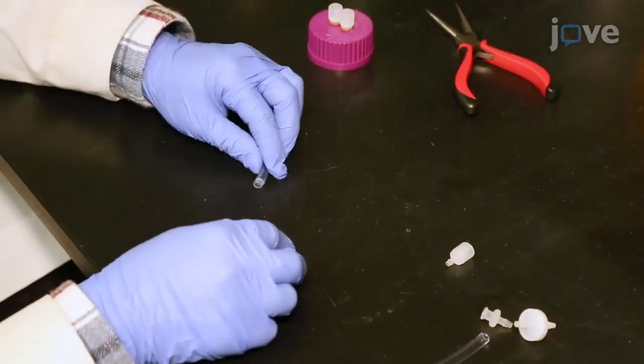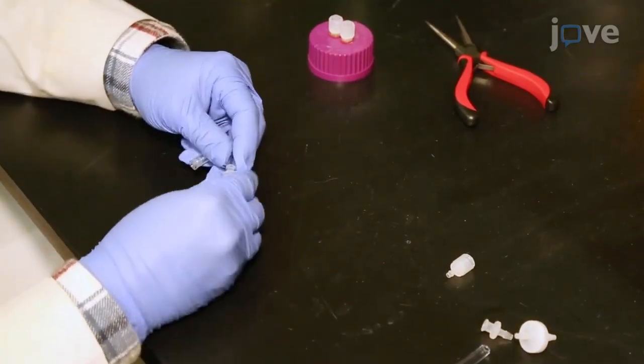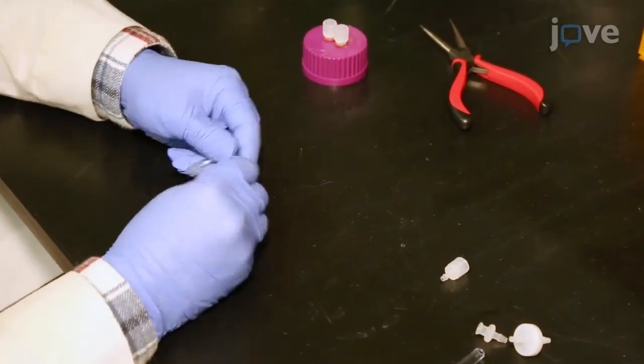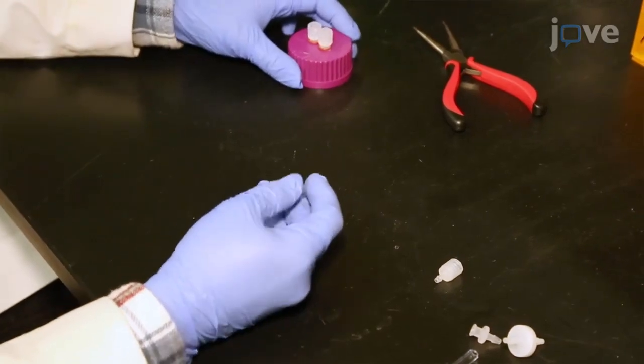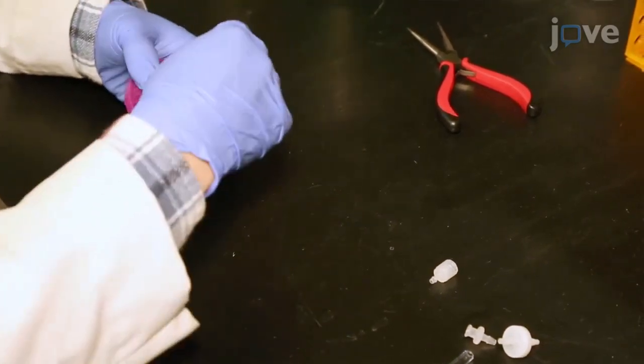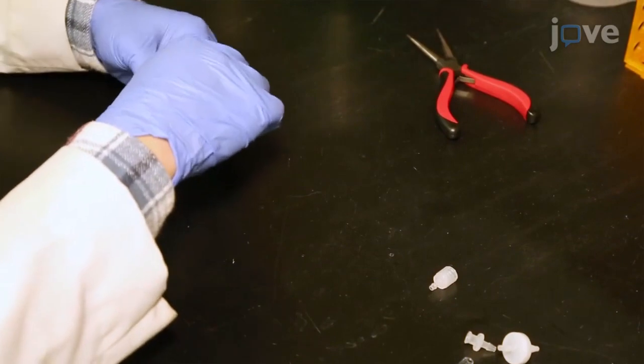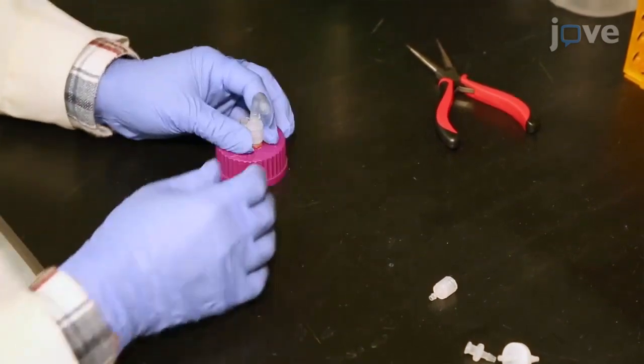For lids that will be used on the bubble column and bottle reactors, attach 1.8-inch female Luer to barb fittings to 1.5-inch pieces of 1/8-inch ID PVC tubing. Attach these to each of the exposed male Luer fittings on the lid.